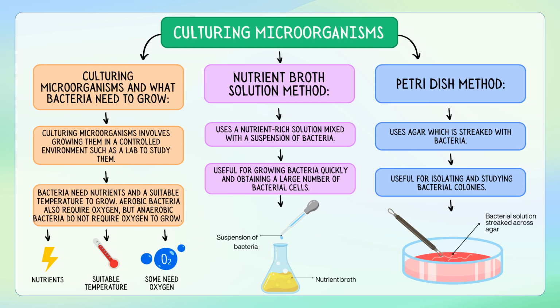Additionally, we reviewed each process, including the incubation process, detailing the optimal temperature and time required for bacterial growth, typically around 37 degrees Celsius for most human pathogens. By understanding these culturing techniques, students can appreciate the critical steps required to study bacteria safely and effectively in a laboratory setting. This foundational knowledge is essential for developing further skills in microbiology and understanding the role of bacteria in health and disease.